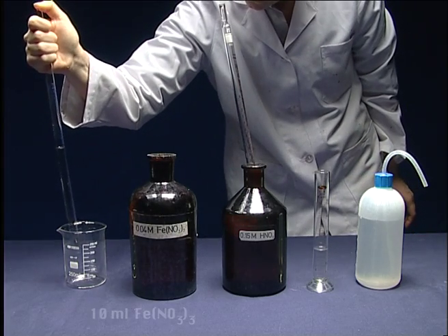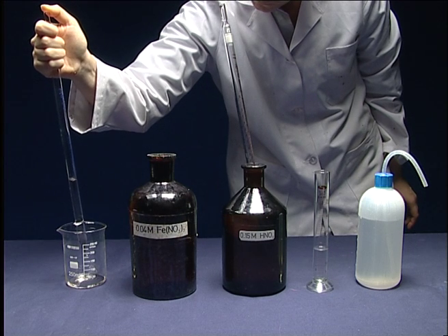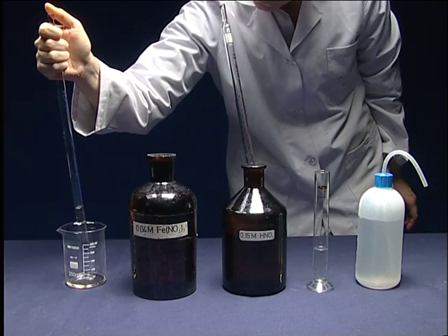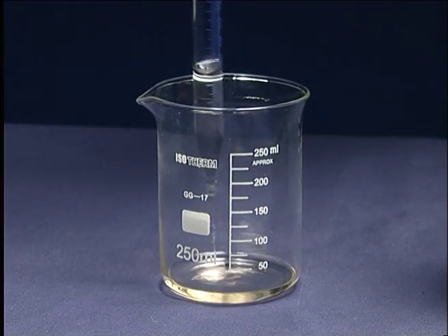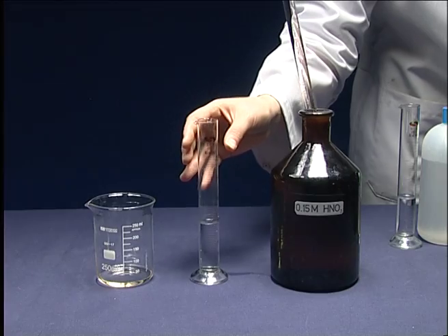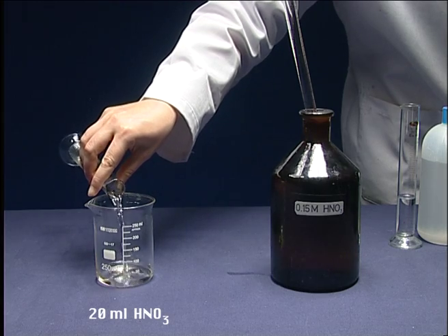Put 10 milliliters of ferric nitrate into a 250 milliliters beaker and add 20 milliliters of nitric acid.